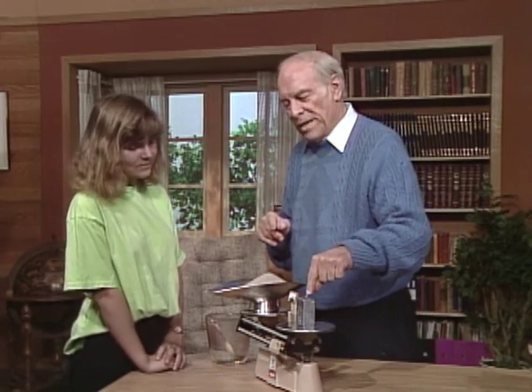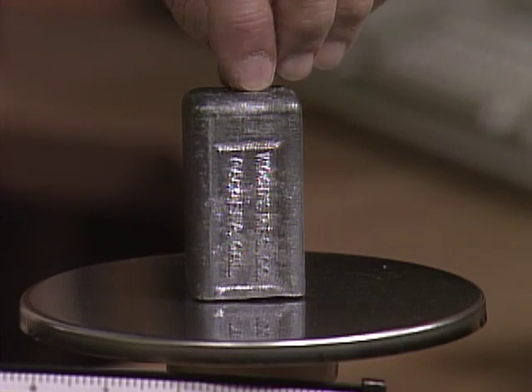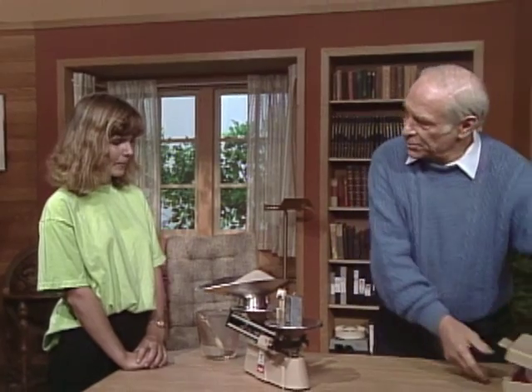You think you have one thousand grams — let's assume you got it all centered. One thing you overlooked: you made the assumption that was one thousand grams because I said it was. But scientists have to be very precise, and to do that they use weights to calibrate. You're going to use one — here's one right here.